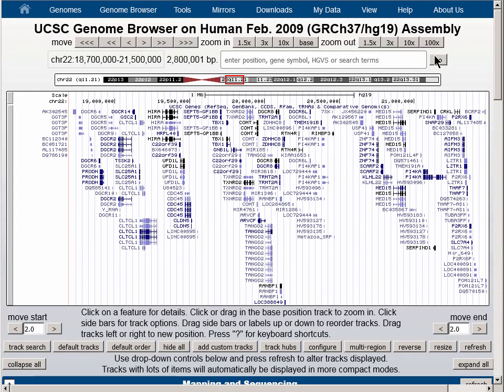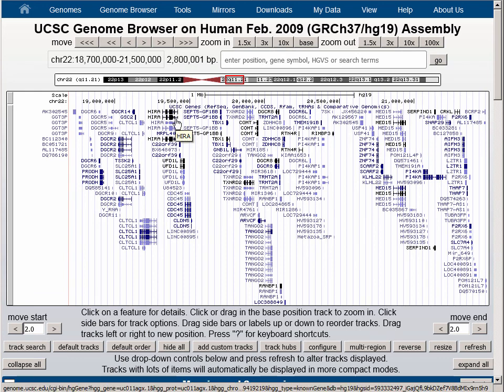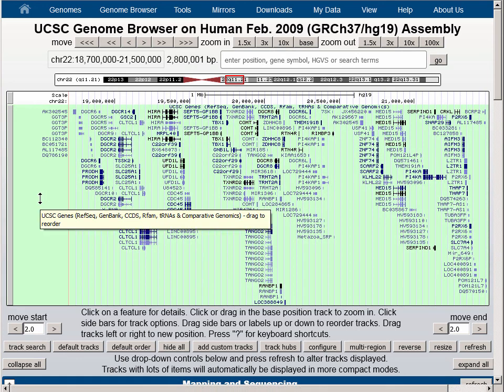So now we have a display with 2.8 megabases of DNA on the page, and all the genes in that region.